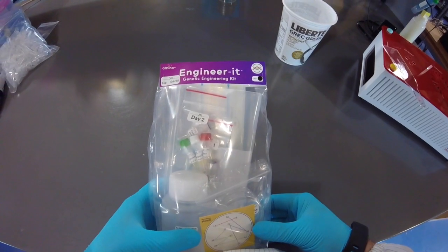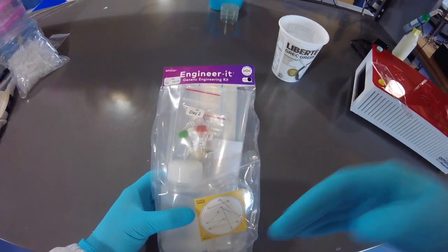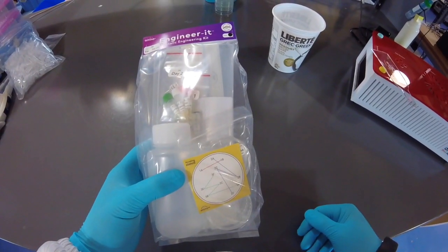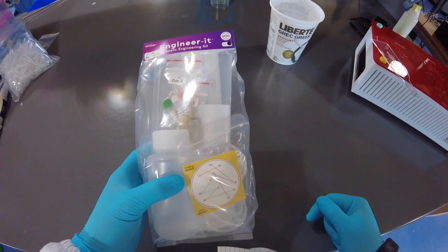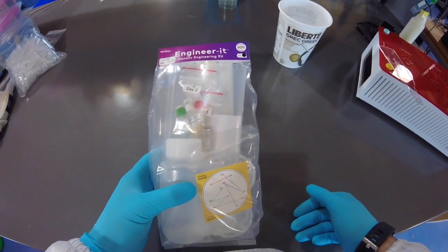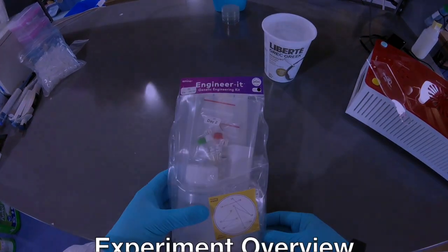And then on day three, we're going to take those recovered cells and put them onto other Petri dishes that we're also going to make today. And then on day four, we'll actually see the results. Hopefully we'll see some nice colorful colonies of bacteria that are producing a colorful pigment that typically comes from ocean creatures. All right, so let's get going.